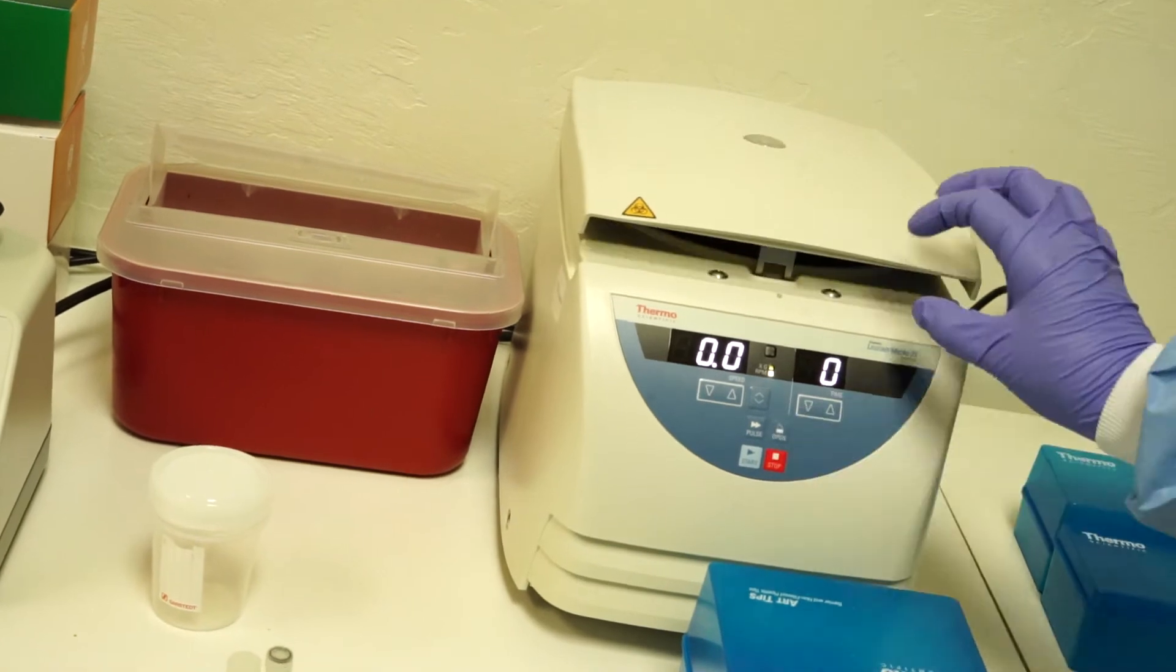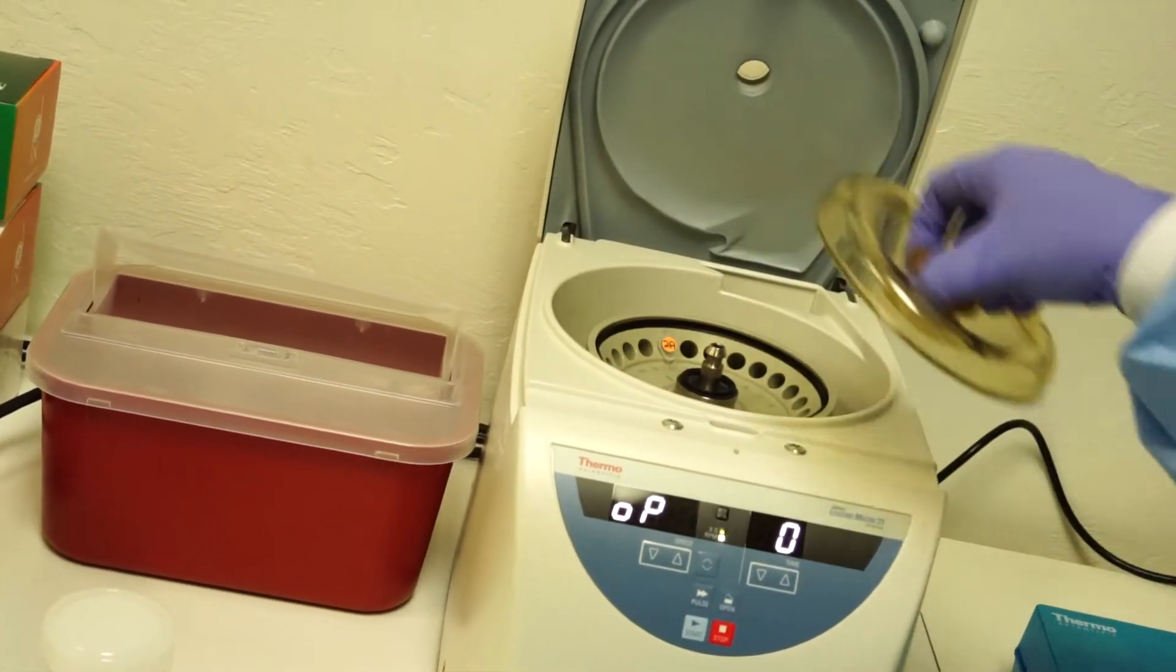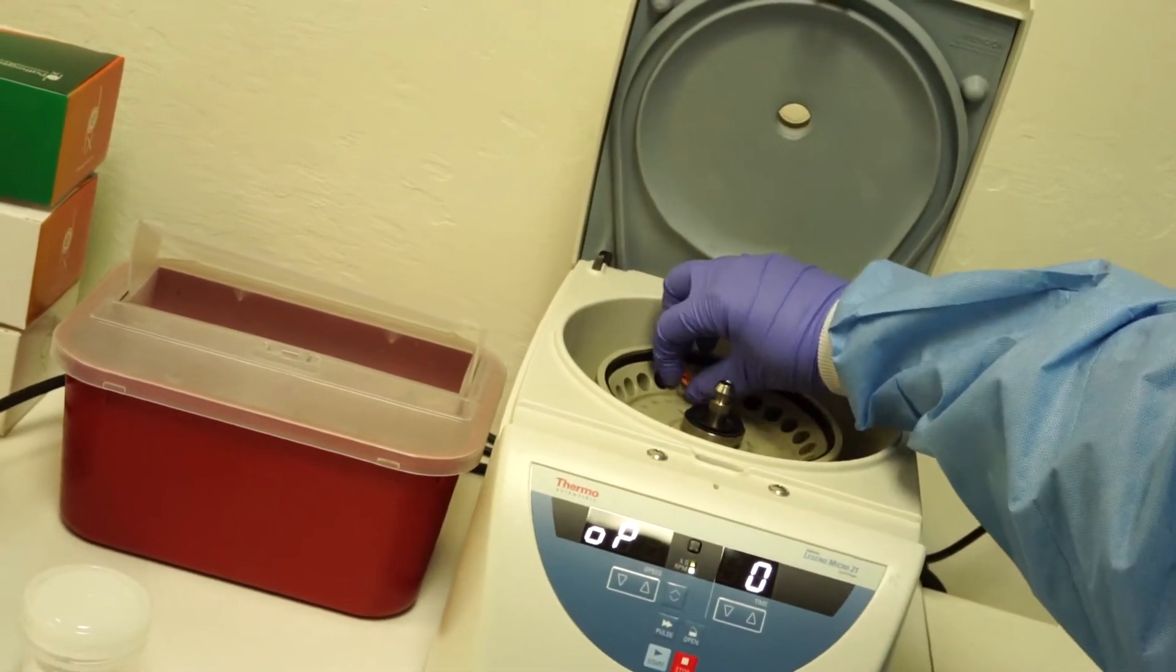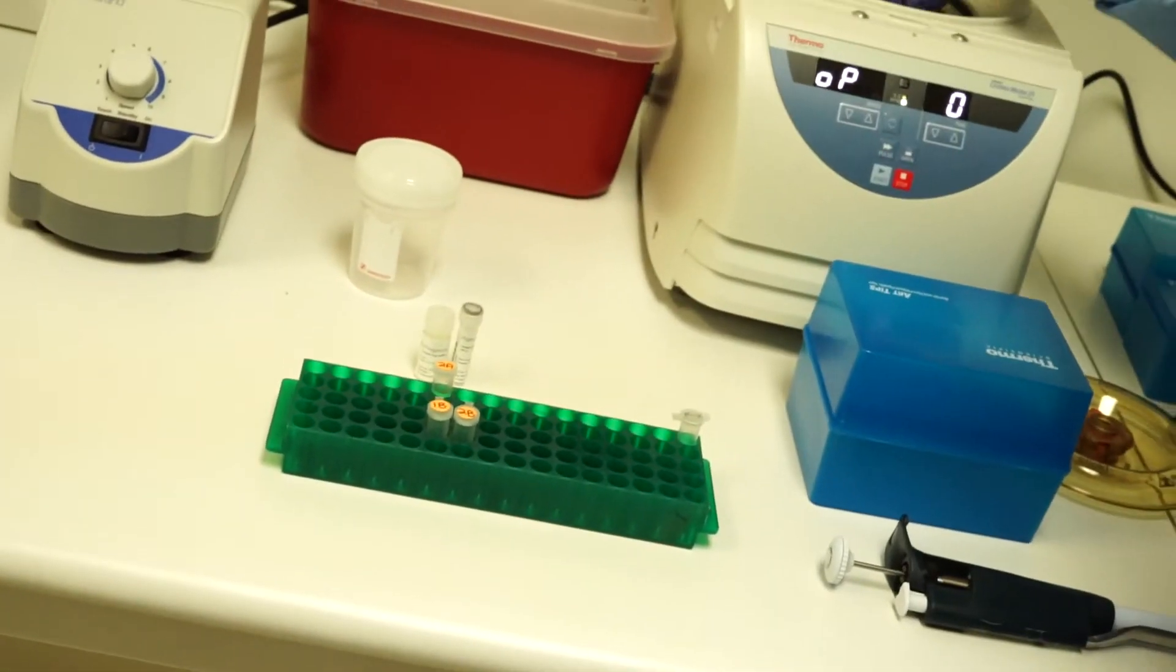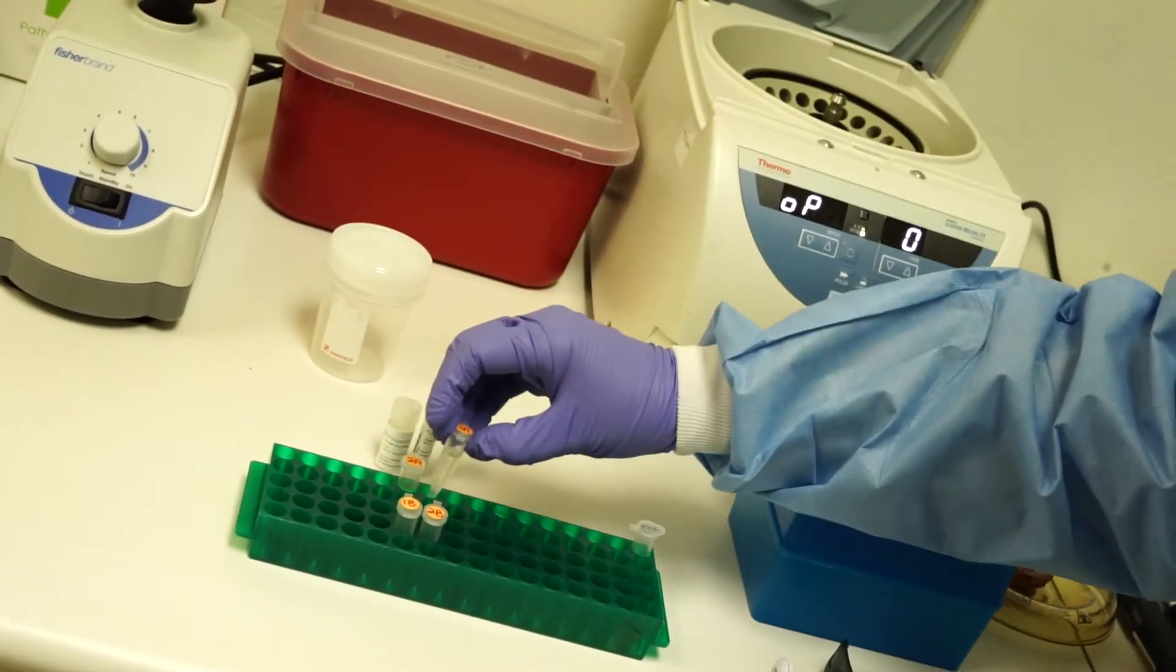Once the samples have centrifuged, remove the samples and retain the supernatant. You should have a clean 1.5 ml tube ready for the transfer.